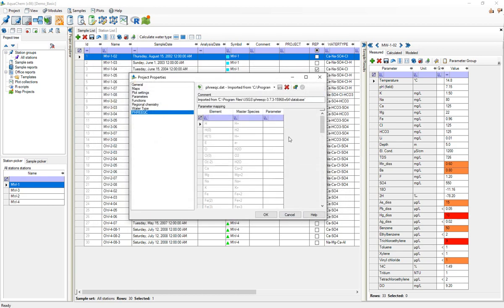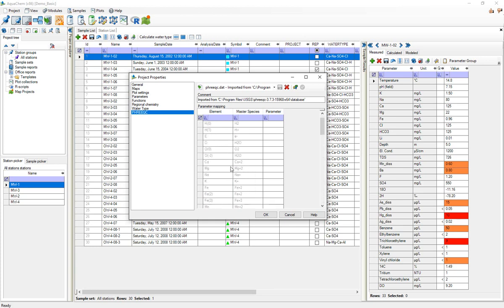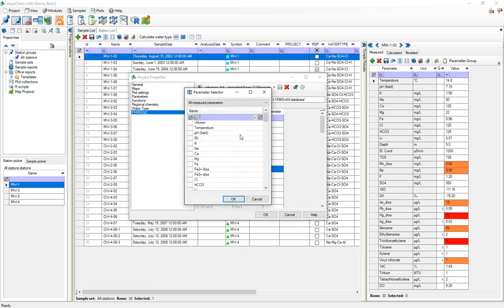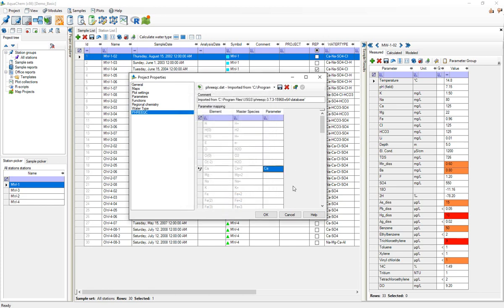Once I've imported this you can see that AquaChem has read out different elements and master species from this PHREEQC database file, but it needs to associate these species to project parameters. So for example this calcium here I could manually assign it to calcium in the database, so I could just select calcium here.